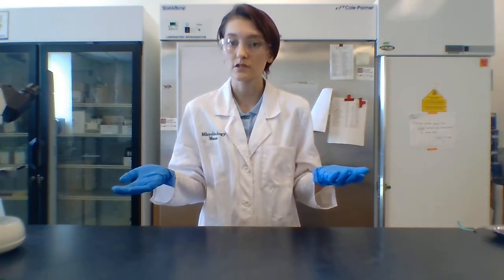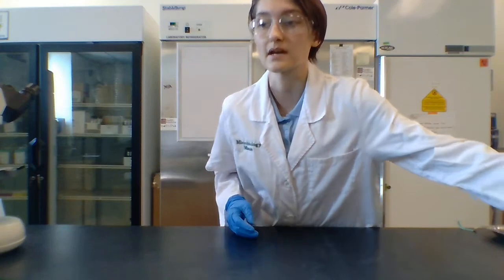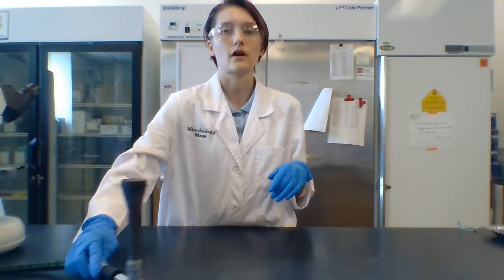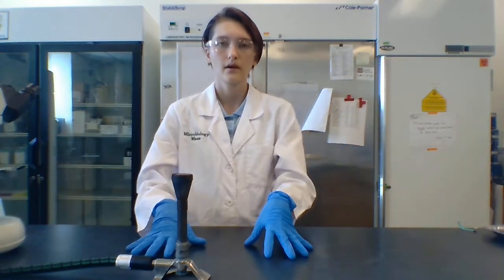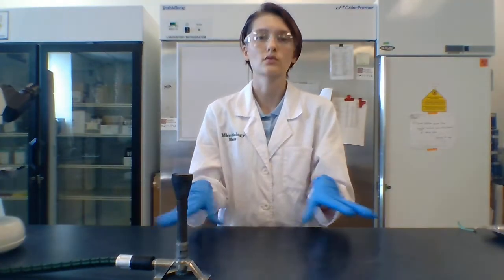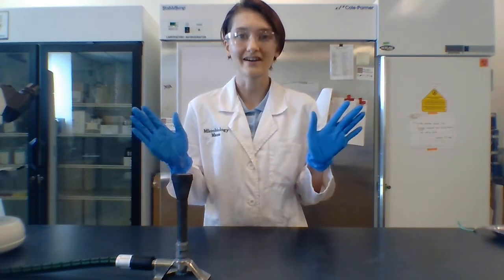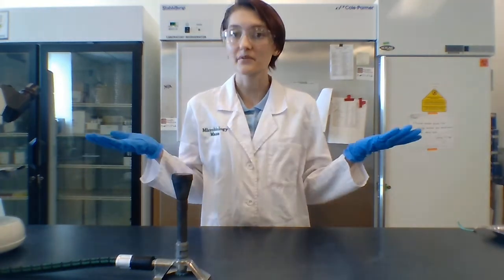Now we're dealing with germs, which means we want to keep the area that is not germs sterile. So I have sterilized this bench using ethanol and wiping it down with a paper towel. But there's germs in the air, so how are we keeping this sterile? Well, I've got a Bunsen burner going, which has fire, and that heat is going to keep the air around this bench nice and sterile. This is a sterile zone, is what we're calling it. Alright, now that we've got our equipment on and we've got our zone nice and sterile, how do we do a lab?